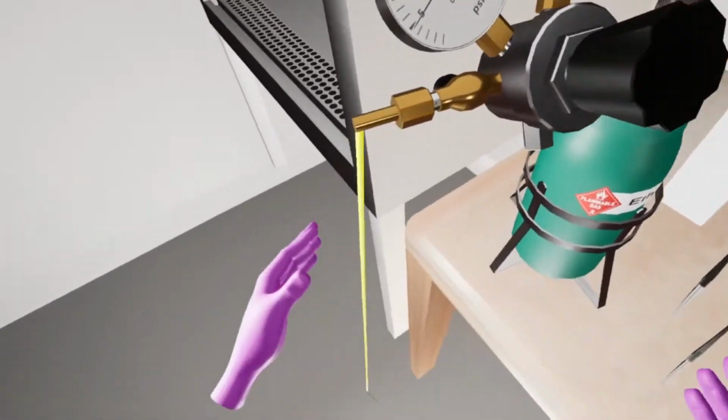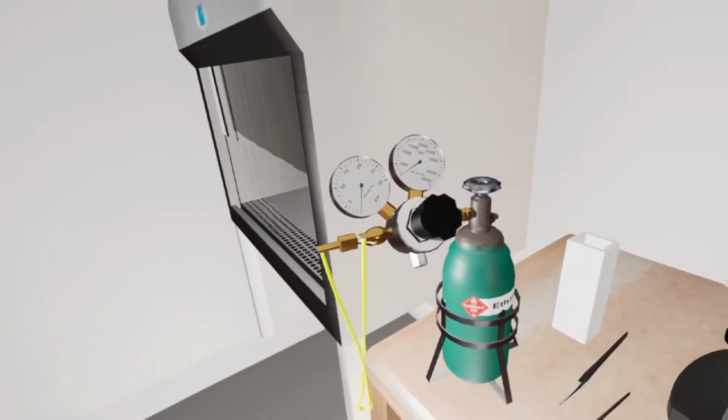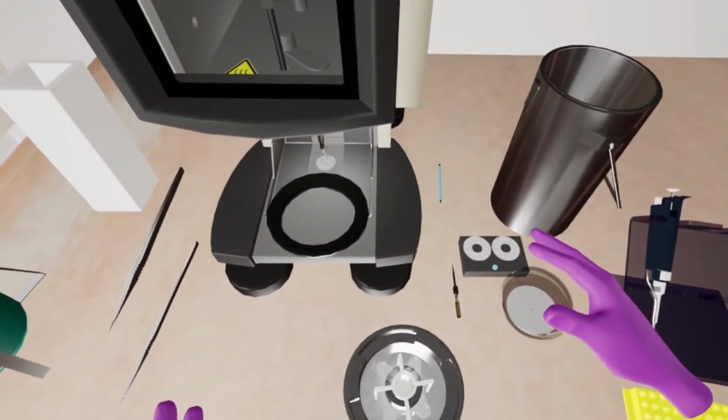Turn the small knob on the ethane tank to close it. Now turn off the ethane tank. When ethane has formed a slurry, remove the spider with pliers.